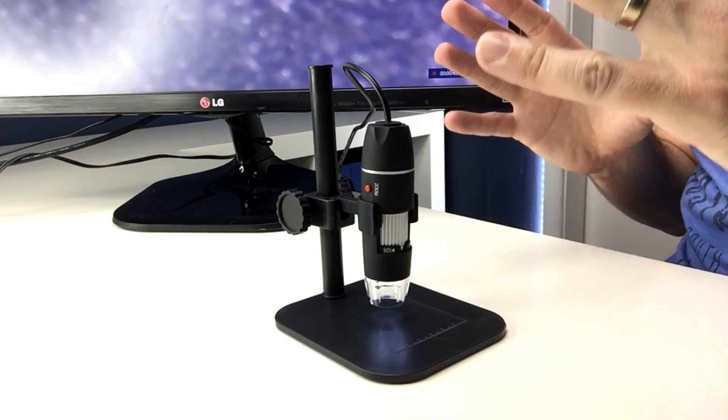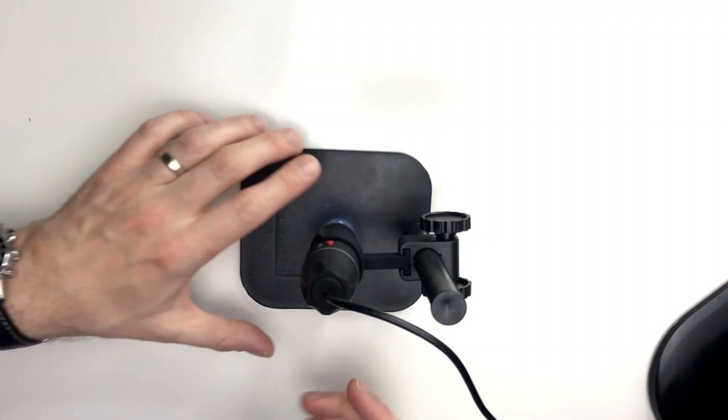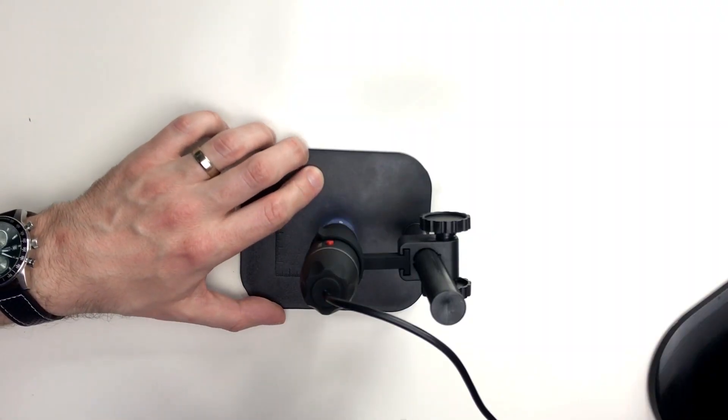So I've actually finally managed to get it set up and I'll be honest with you, you will need a screwdriver. I thought I could just do it by hand, but no. If you're trying to set this up somewhere, maybe on the road, take a screwdriver with you.